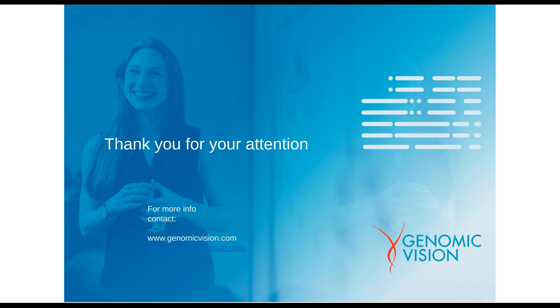So the first question relates to FSHD: what is the genome requirement per cover slip for FSHD? Hi, Mark, and hi to all the presenters of this webinar. So just to answer the question, we have seen that on a cover slip we have about 100 genome equivalents.